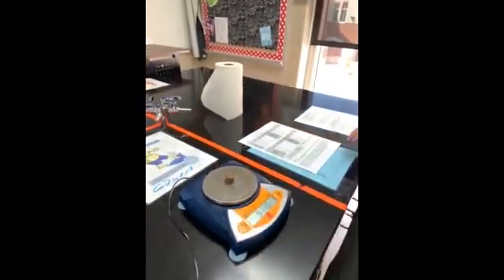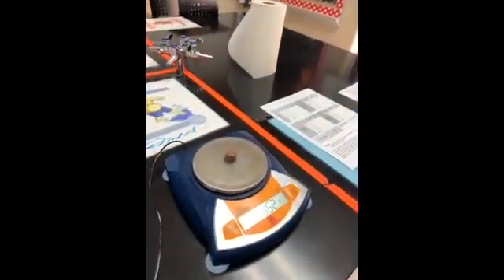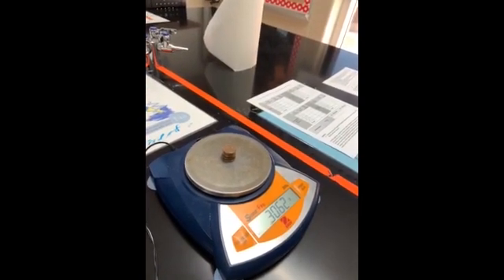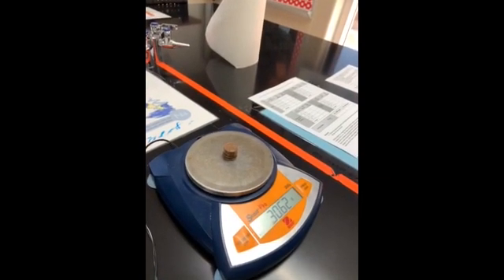Trial 2, pre-82 pennies, mass. Again, make sure you get the number. The last digit may or may not stay still, and that's okay. All right.